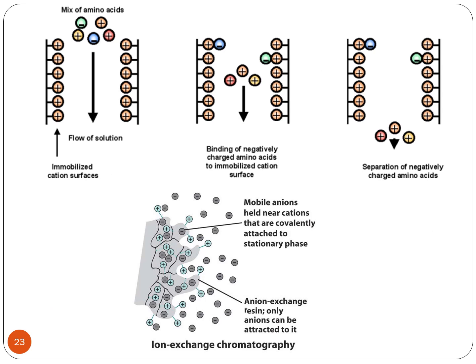Okay, so kita tengok terus. Okay, so untuk anion exchange chromatography, anion ni ada negative charge. So kita nak tahu analyte kita ni adalah anion. So kita punya stationary phase which is polymer beads tadi, dia akan attach with the positive charge.